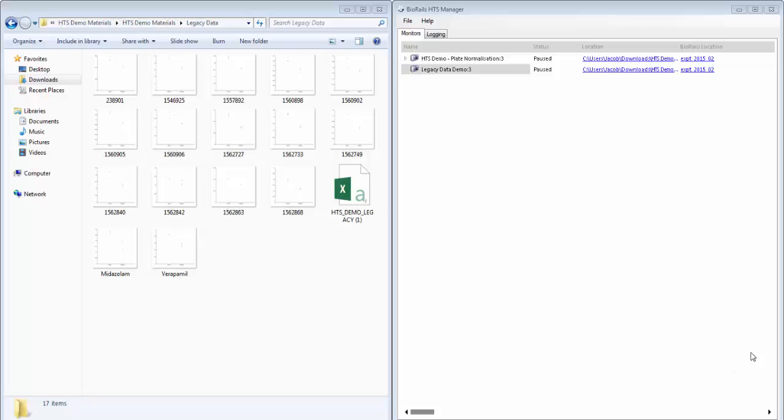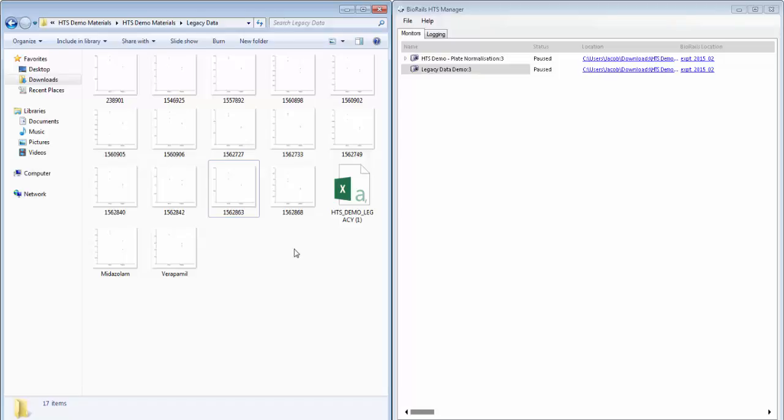In this particular example, we have the analyzed results here on the left for a blood plasma binding infinity study and we want to upload them to BioRails so that they can be searched for along with any new results.